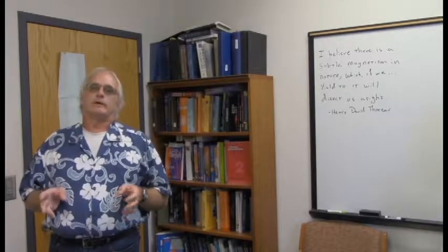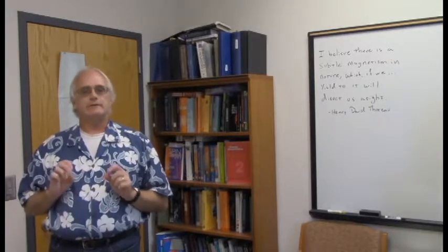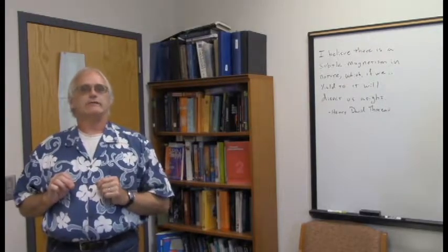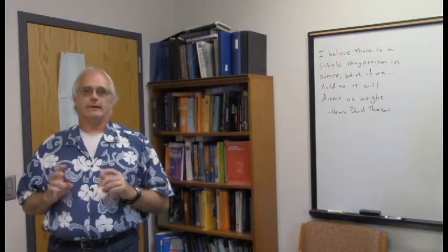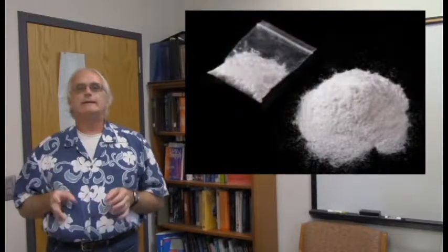Today we're going to walk through the solving of an unknown structure based solely on the NMR spectra, and in particular with a major assist from 2D spectra from COSY and an HSQC spectrum. And we're going to pretend for a moment that our situation is simply this. We have this mysterious white powder, and we don't know anything else about it.